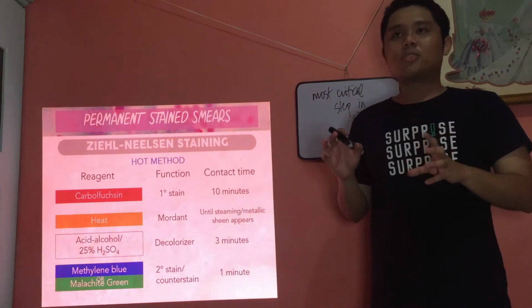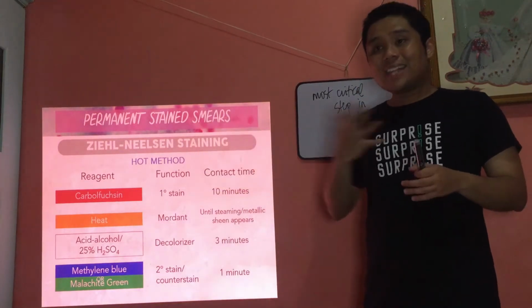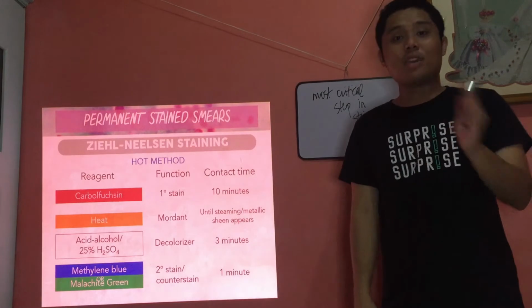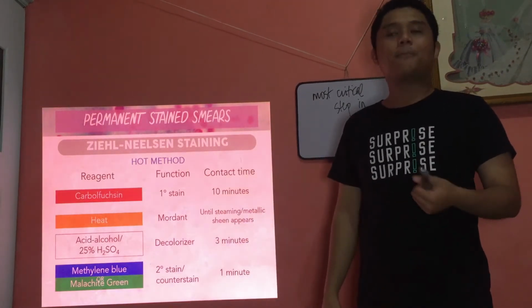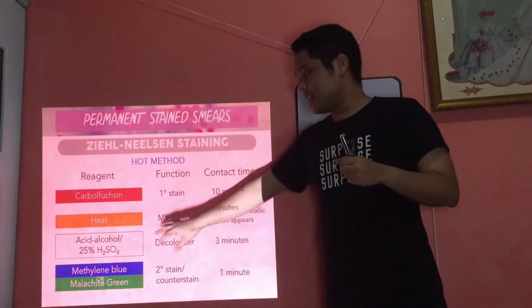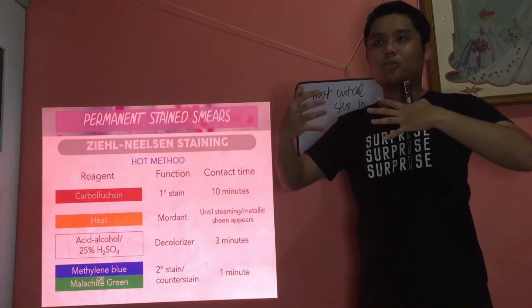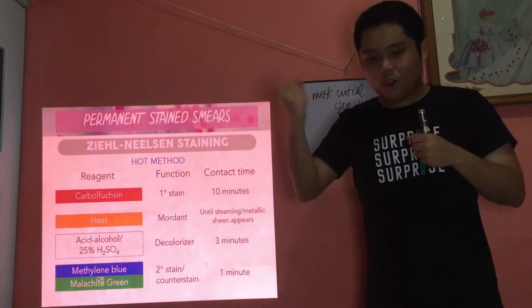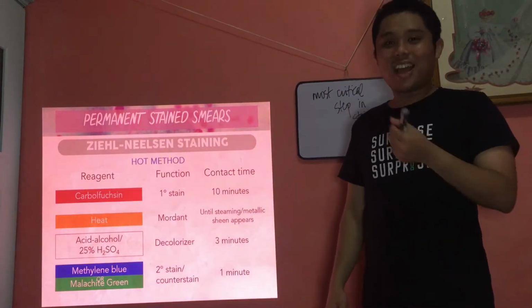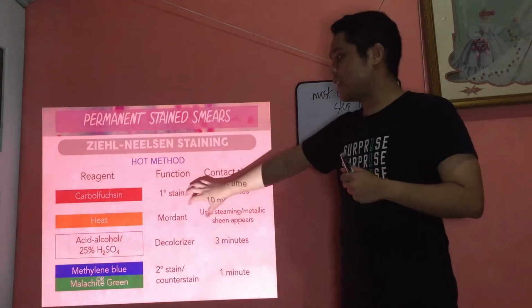It's the reagent that we use so that we can divide the two. When we add decolorizer, if it's a true acid-fast organism, the decolorizer will have no effect. The relationship between the mordant and the carbolfuchsin will remain, because the relationship is strong. The many long-chain fatty acids were able to capture and take hold of the carbolfuchsin. Even if a third party like the decolorizer comes in, the relationship will not break.